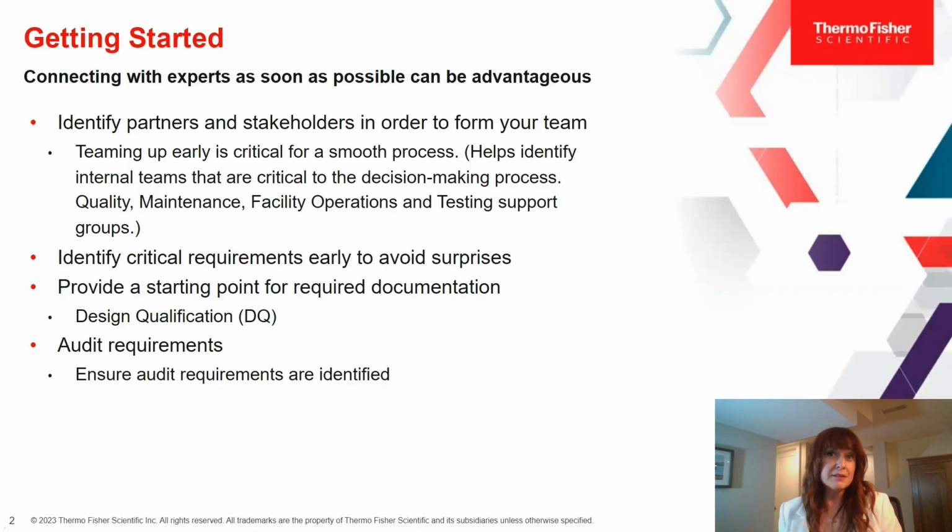But the reality is, it can really have an impact, right? So we want to make sure that we're conserving the integrity of your samples, the integrity of your reagents, so that when you go to perform your experiments and your protocols, this is certainly not a variable you have to worry about when it comes to troubleshooting. So we want to make sure you have success from the beginning.